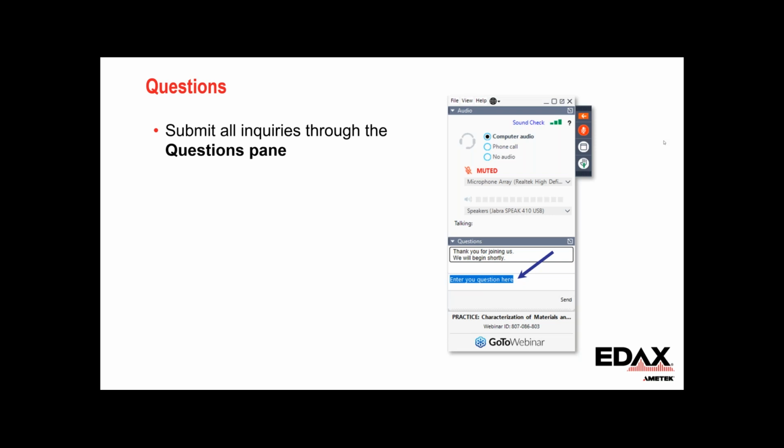Yeah. So I think traditionally EBSD detectors have had a significant number of pixels compared to the number of degrees of freedom. Ultimately, there are 6 degrees of freedom in the pattern that you're indexing, 3 for the pattern center and 3 for the orientation. So if you have an 8 by 8 pixel image, you have 64 pixels for 3 degrees of freedom. Obviously, they're not fully independent. But this is one of the areas where having a forward model and the ability to simulate patterns can help you start answering this kind of question quantitatively.